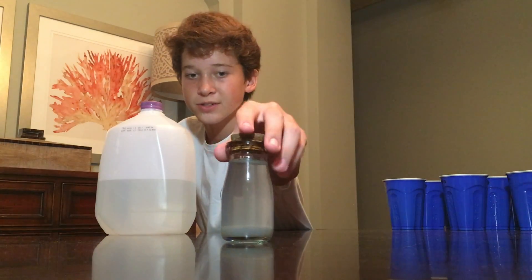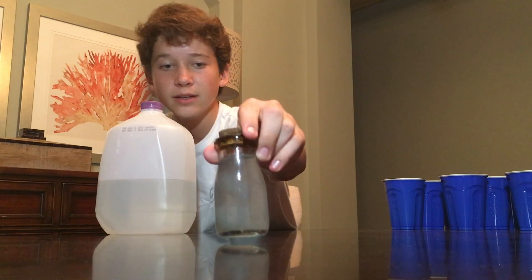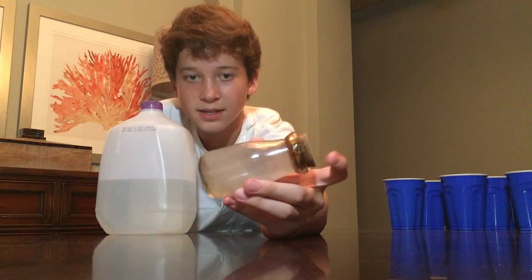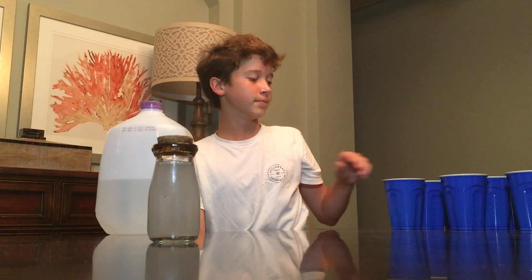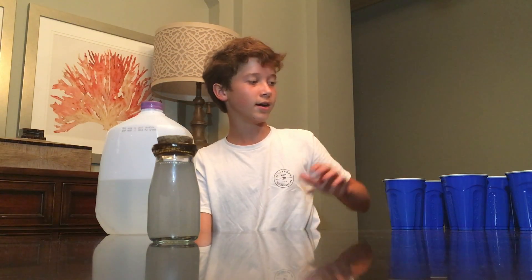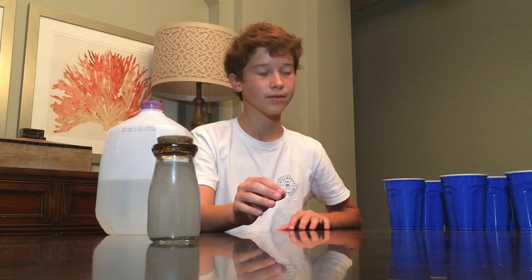Today I'm going to demonstrate Avogadro's limit with some sodium cyanide, which is a completely saturated solution of sodium cyanide right here. I'm going to dilute it so much that it's just a probability that there's even one atom inside of this solution.